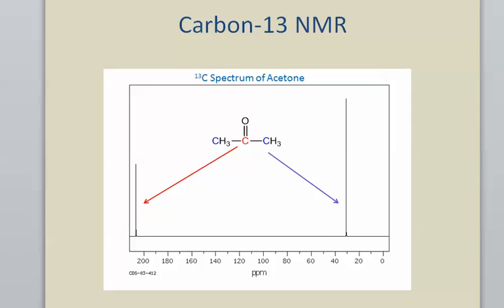And so as a complement to the proton NMR spectrum, you can run a carbon-13 NMR spectrum, and it tells you something about the numbers of carbons in atoms, just as we can count hydrogens by doing the examples we've been looking at.